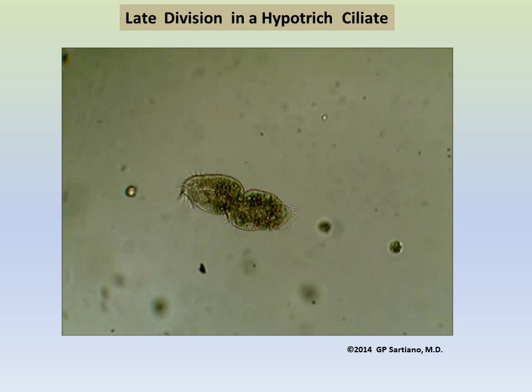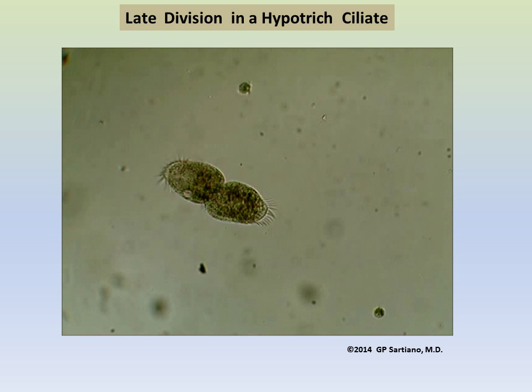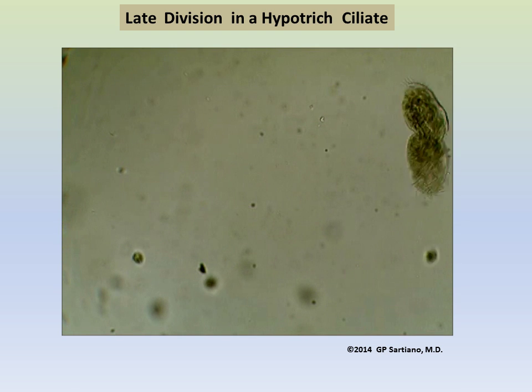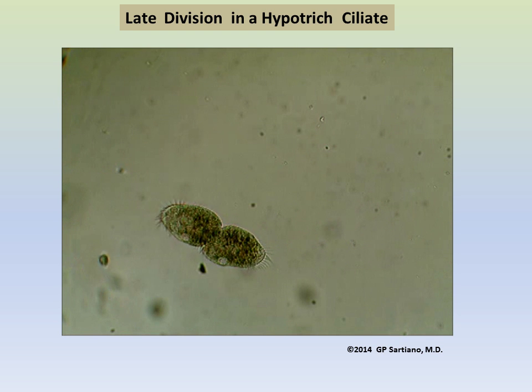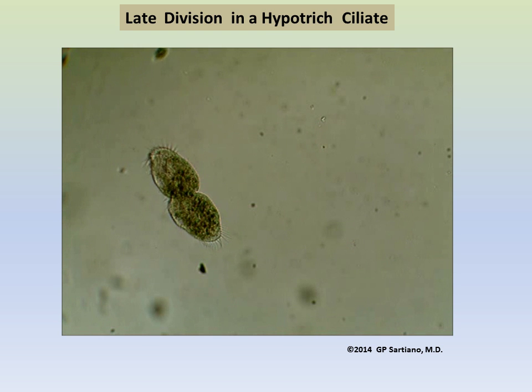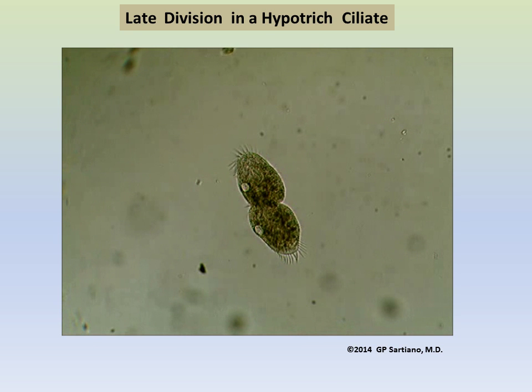Note that both organisms have now developed visible contractile vacuoles in more or less the same ventral anatomical location. They too seem to have synchronized activity, both filling and emptying, although at times the anterior vacuole seems to be somewhat in advance of the posterior one in the cycle.